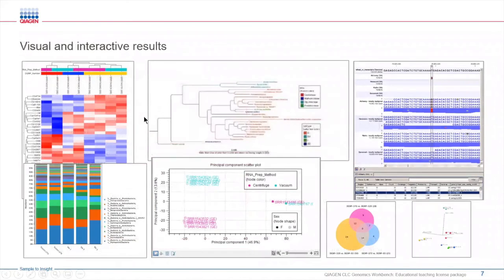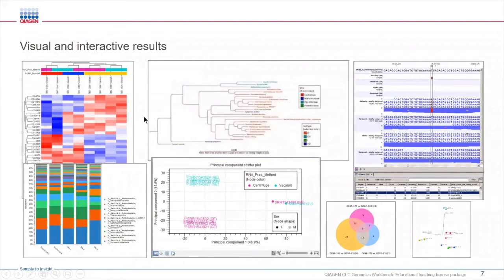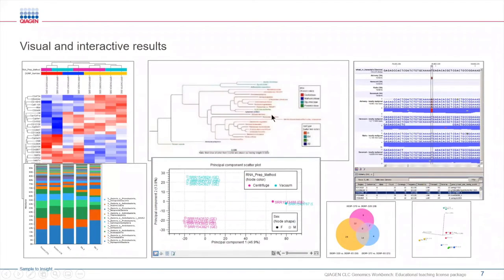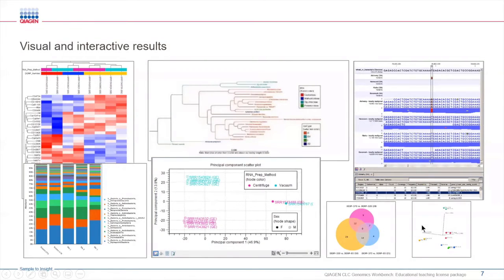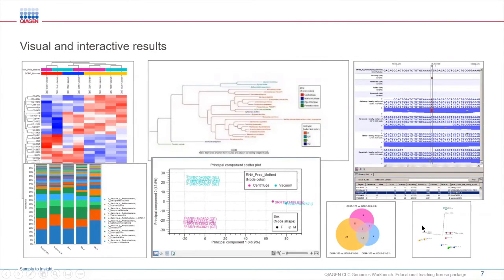The various tools in the toolbox generate a wide variety of interactive visual outputs, like heat maps, bar charts, phylogenetic trees, variant tracks, Venn diagrams, and PCA plots. These interactive visuals can be customized and enhanced with the addition of metadata.